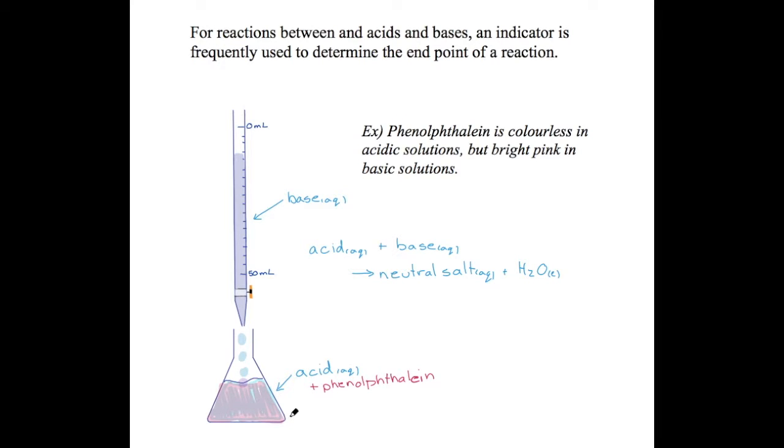All right, so the solution, in fact, by the time we're done, will be basic, but the amount of volume required in order to complete the reaction will be very accurately measured. If anything, the base will have been added in excess by maybe half a drop, which is in fact quite good.